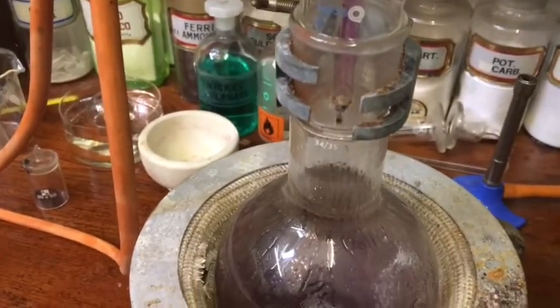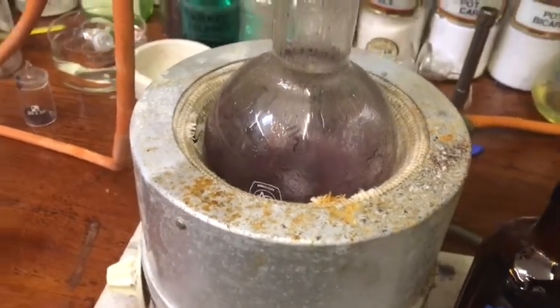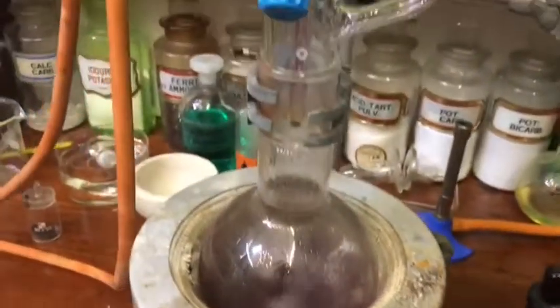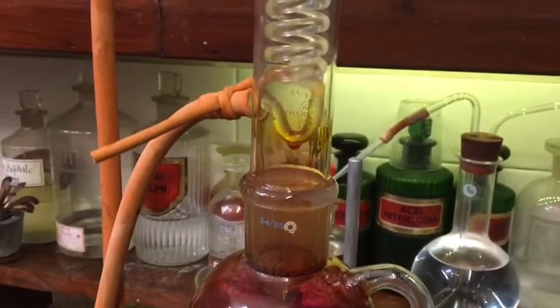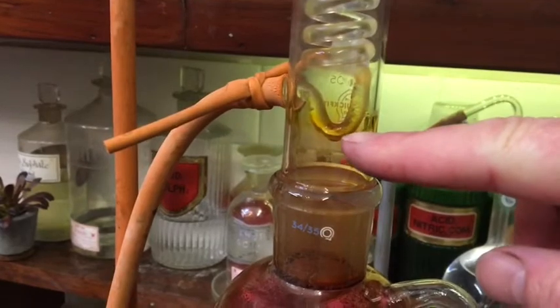This allows, instead of a very vigorous reaction where you get big clouds of hydrogen iodide, a nice slow regulated reaction. The advantage also is that you can distill the whole product off into the separating funnel without necessarily burning it on the bottom. As you can see, the iodine is dissolving into the butanol alcohol and then drops down, dissolving even more iodine.